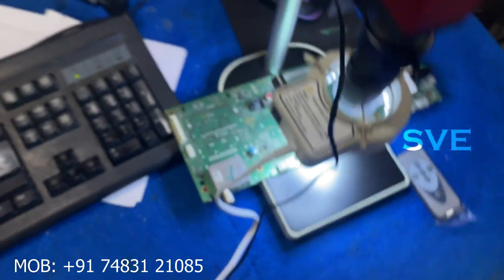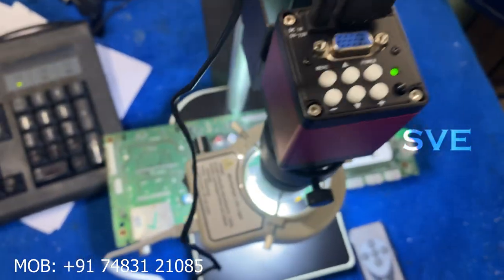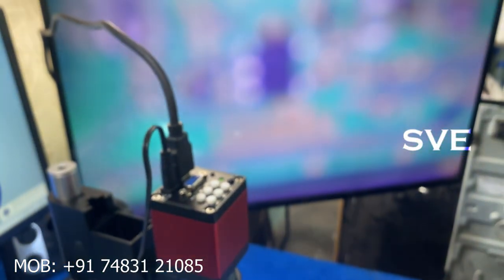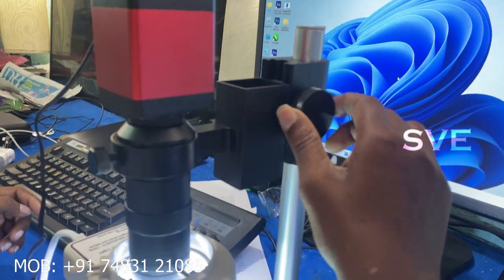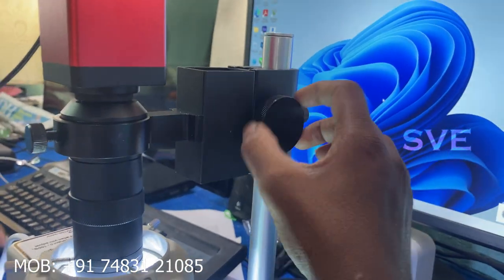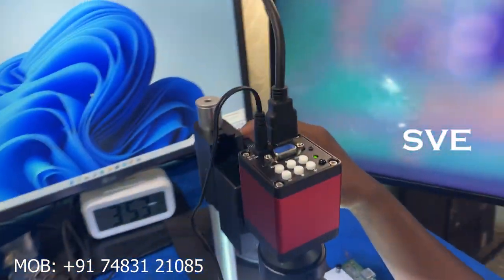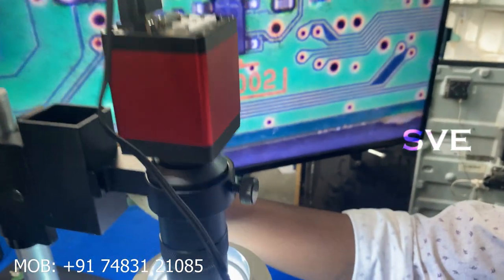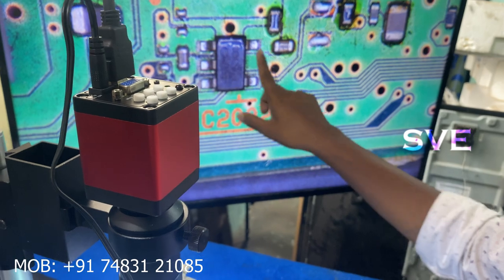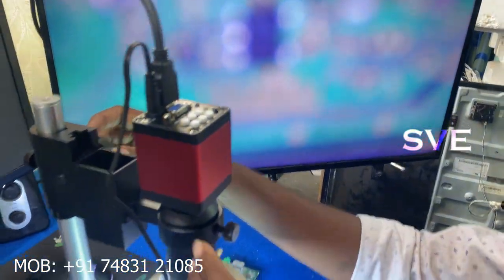Next, let's turn on the microscope. Have a look at our TV — the microscope is all set now. And this is the height adjustment, we call this a hard adjustment also. With the help of this knob, we can adjust the workspace between our board and the microscope. If we need more space, we can move it up.